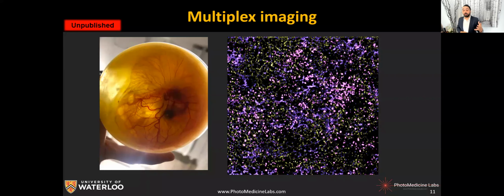This image was actually taken by PARS, taking advantage of, as I mentioned, 4 different wavelengths on the chicken embryo. We can look at DNA, cytoplasm, and oxy and deoxyhemoglobin optical absorption to form this level of images. This work was done by postdoc Kevin Bell in the lab.